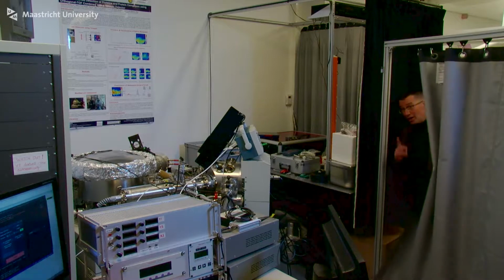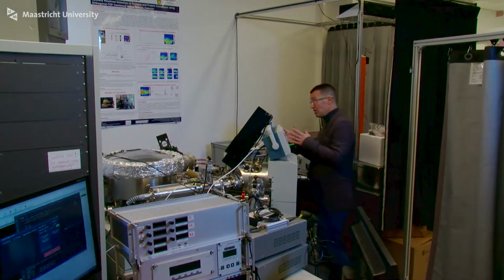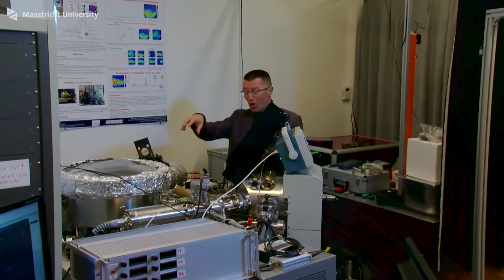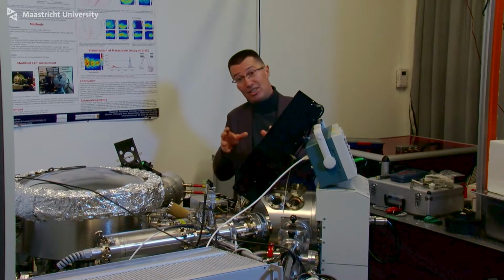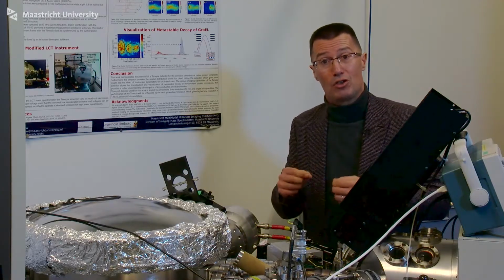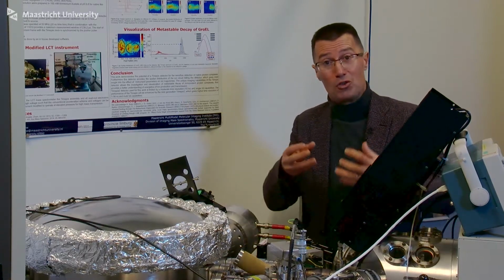So I want to show you guys something special. One of the things that we do here, as I said, is engineering, whether it's laser physics or mass spectrometry. Here at the back end of the mass spectrometer there's a detector. And this is actually a very special detector because this is a detector that we've taken from CERN, came here where we use it to look at our biomolecules. So really, as I like to say, from CERN to the surgeon.